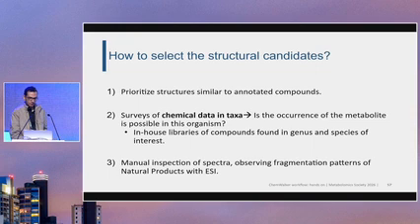you are working with. Third, you must perform manual inspection of the MS/MS spectra, observing fragmentation patterns of natural products, for example, in electrospray ionization.